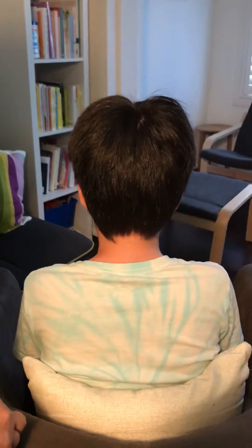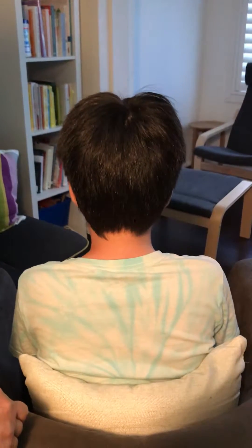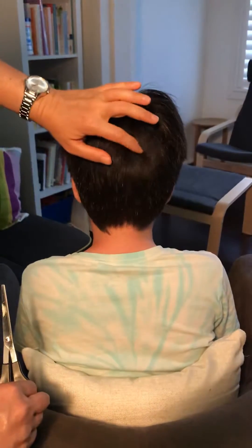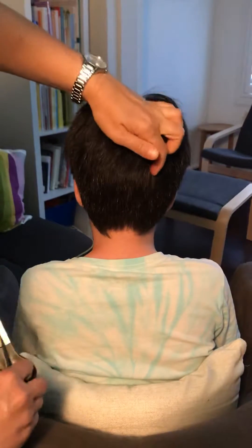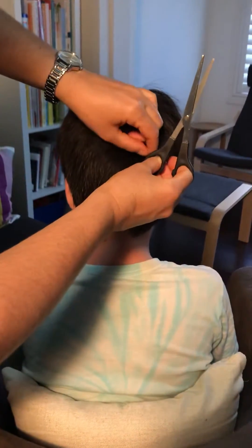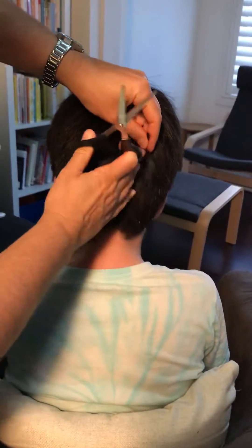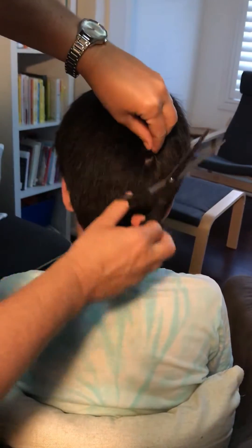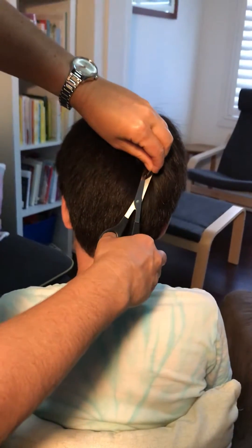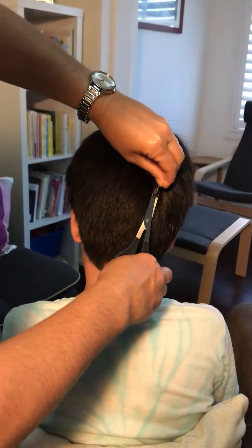Hi everyone, this is a quick demo to show you how to take a great hair sample for your hair mineral analysis. If your hair is quite short like this, we need to come into the back of the hair and cut really close to the scalp. Grab a few hairs like that, then use clean scissors — make sure there's no rust on the scissors — and take a little bit of hair.